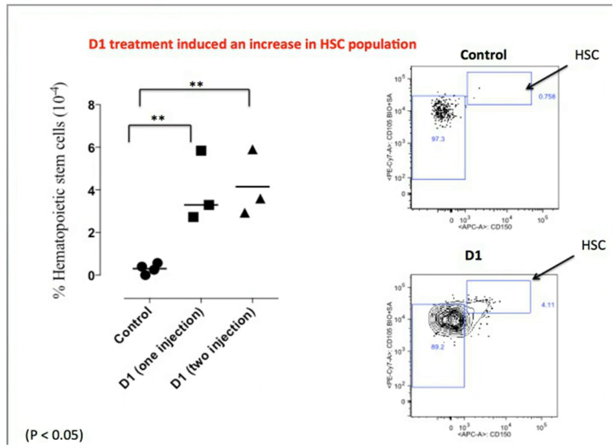So these two research exercises that I have described actually originate from a phenotype-based profiling approach. The first one on cancer stem cells and the second one on embryonic stem cells.